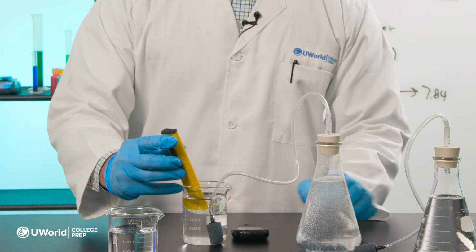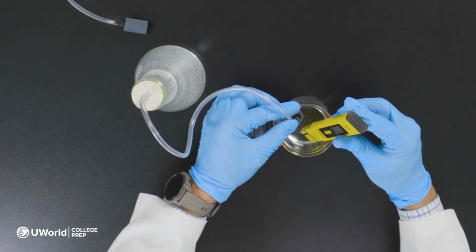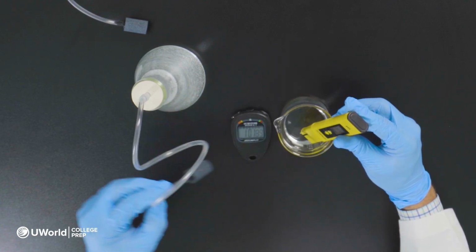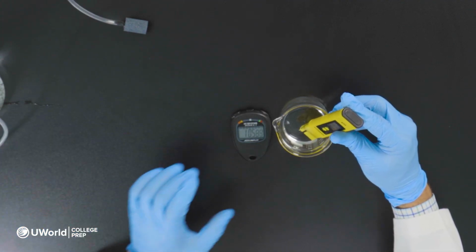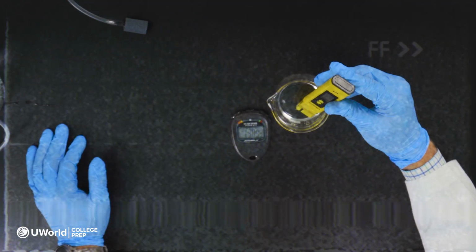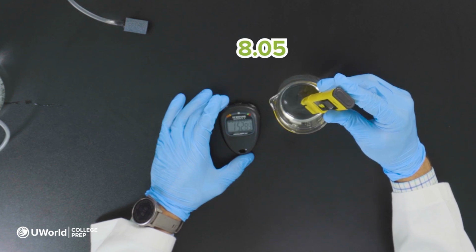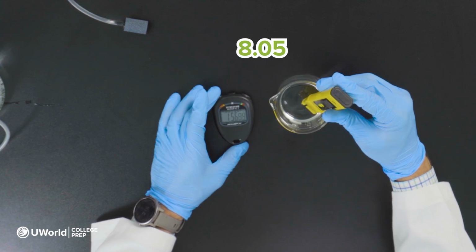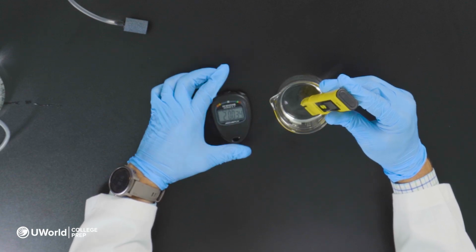So same thing as before, we'll let it go for about a minute and then we will remove our air stone and we will continue to measure. And guess what? We're still at 8.1 in our distilled water. Now there's a little bit of change. We're at a whole whopping 8.05. So a little bit of a change, but not really considered significant. And we're staying there until about the 2-minute mark or so.